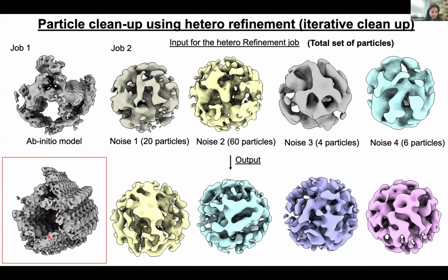Now, if we take a single dimeric unit and rotate it by 90 degrees, we see that each Cat1 monomer is present in a twofold symmetry. And if we rotate the whole filament assembly, we see that there is a twist.